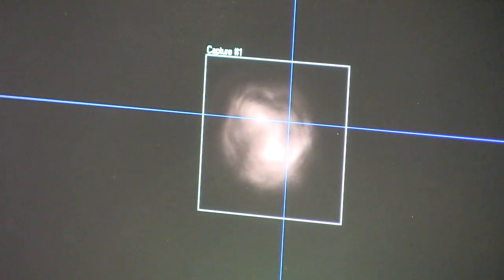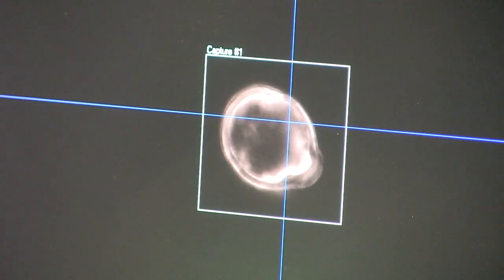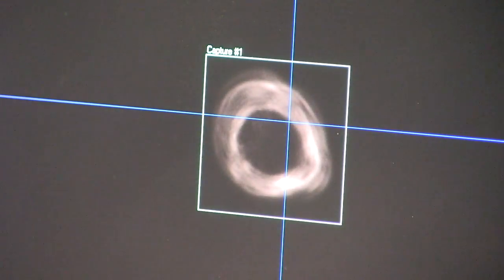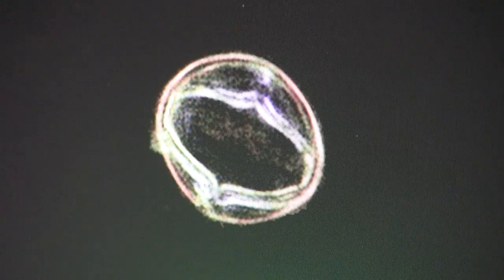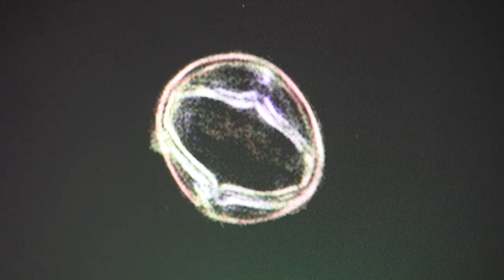The high resolution camera captures a series of images along the z-axis of a pollen grain. It then takes the most in-focus portions of each of those images and compiles it together to produce a composite image, the example of what you see on the screen now.